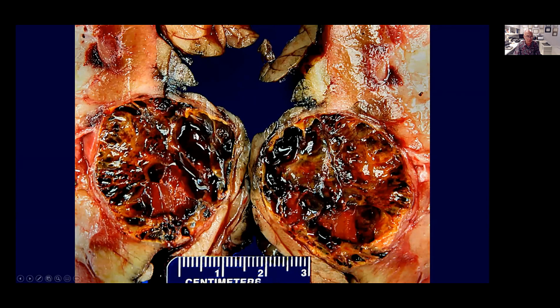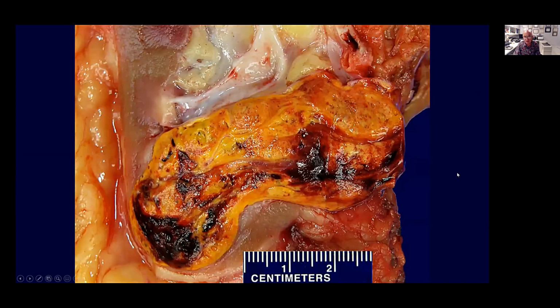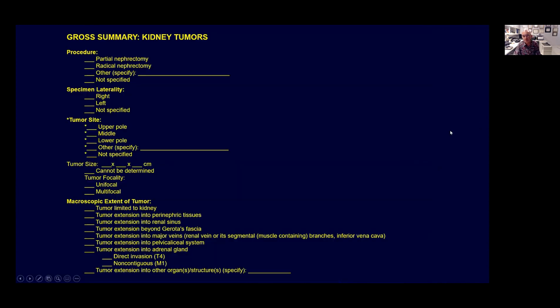And this tumor is completely different to the previous ones, with all this irregular appearance and colors and cystic appearance, etc. Also document the tumor is invading the renal vein, and in this particular one, there is a big thrombus that is being projected from the tumor into the vein. Here is the pelvis, and this is the most external surface, the perirenal fat.